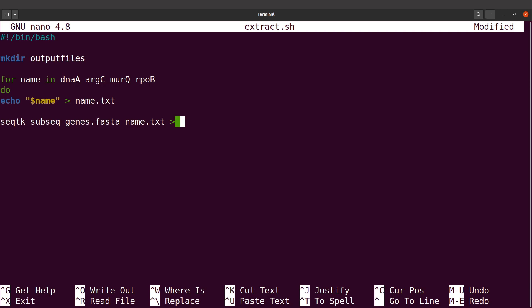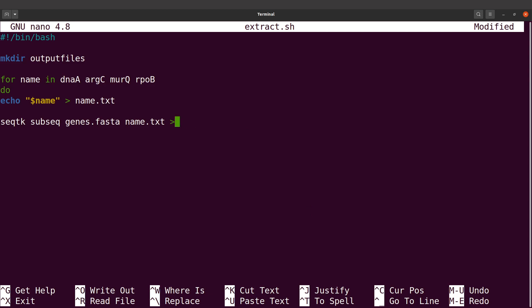We also indicate our output file using the greater-than symbol. We say "dollar name" in double quotes and then say .fasta. But to avoid getting the output files mixed with other files, we save them in the output directory. So rather than just dollar name, we say output_files slash then the output filename: double quotes dollar name, double quotes, dot fasta. Now this command is complete.